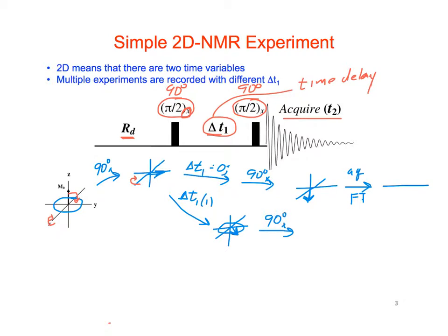And so if this is sticking out this way, when it rotates around the XY plane, it's going to rotate down into this quadrant down here. So maybe I need to draw those a little bit bigger. So it's going to rotate from here down to here.